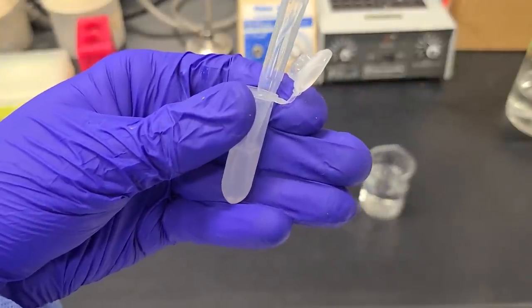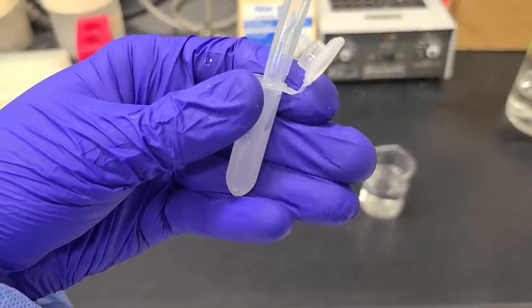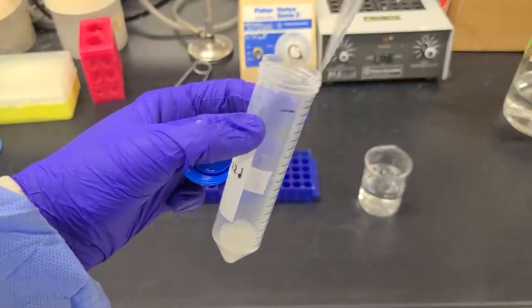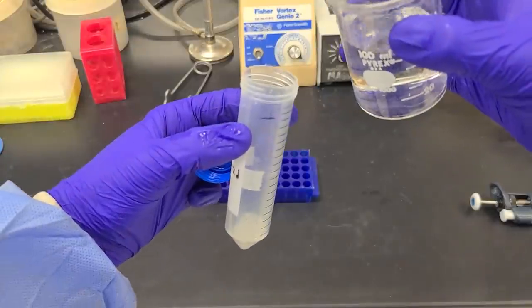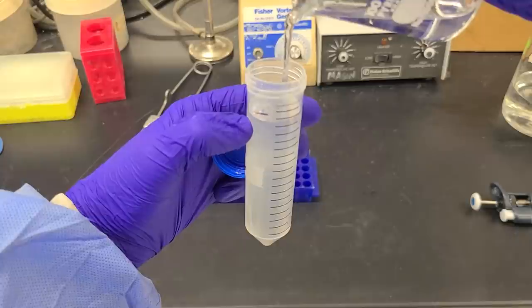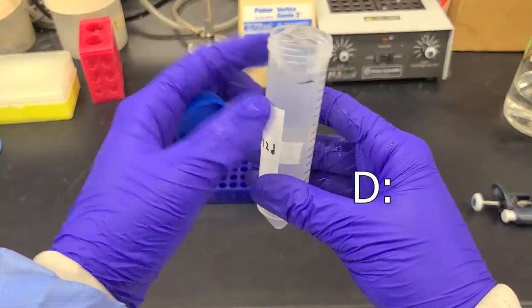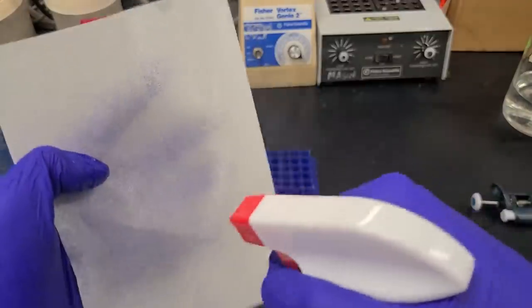So this is a buffer that will help the bacteria infect plants. All right, we're going to add it to this tube and then add more of that infiltration buffer. Definitely just spilled that everywhere.